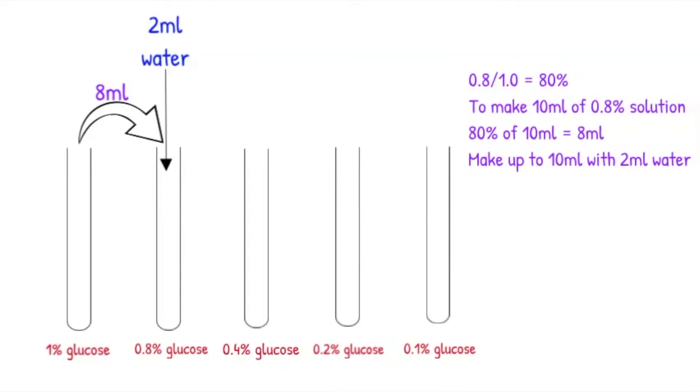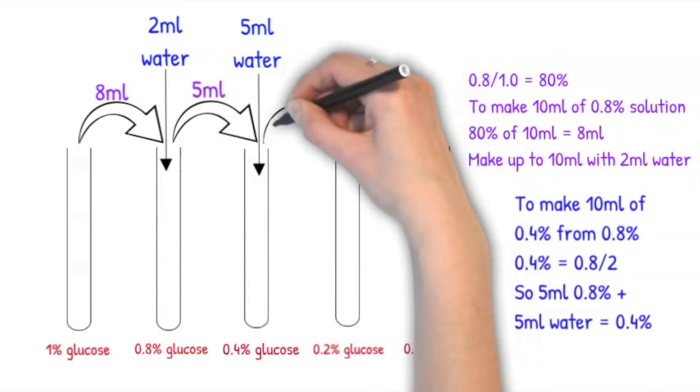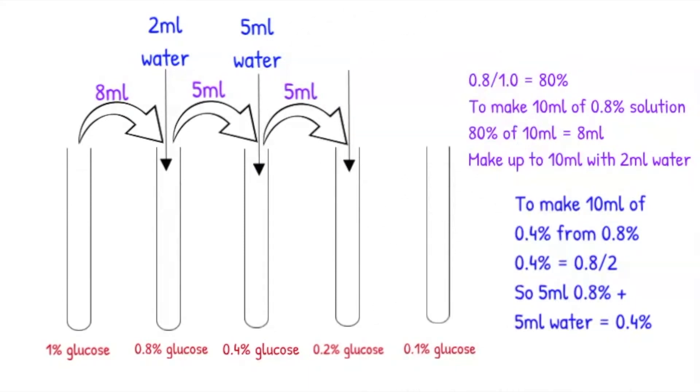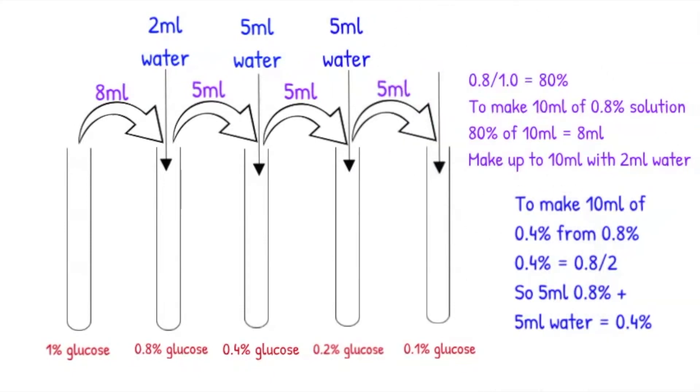It is then much easier because we are going from 0.8% to 0.4% and 0.4% is half of 0.8%, so we add 5 milliliters of 0.8% glucose and 5 milliliters of water. We then repeat this to make 0.4% into 0.2% and 0.2% into 0.1% glucose.